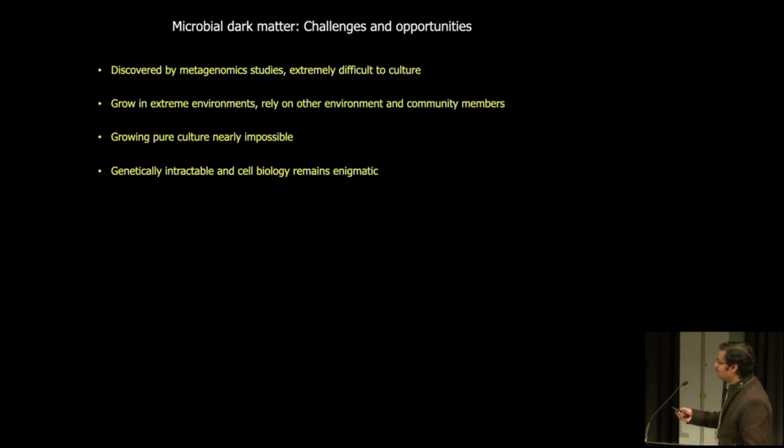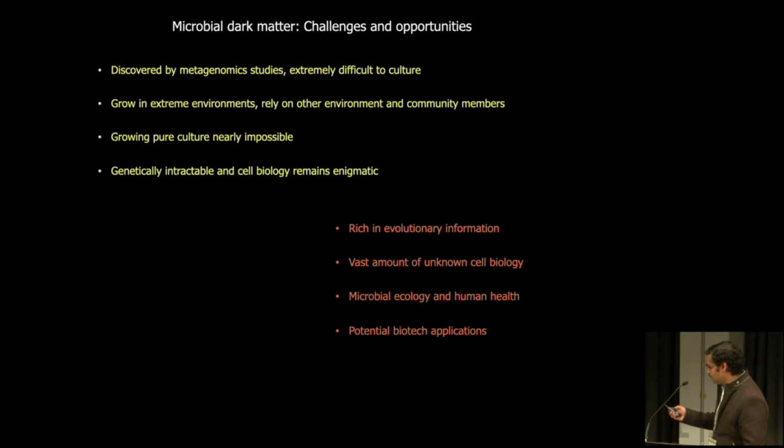And as I said, they grow most of the time in exotic, extreme environments, so it is very difficult to replicate those kinds of environments to grow them. And getting even a pure culture or an enriched culture is extremely difficult. That's why that sort of cell biology remains really enigmatic.